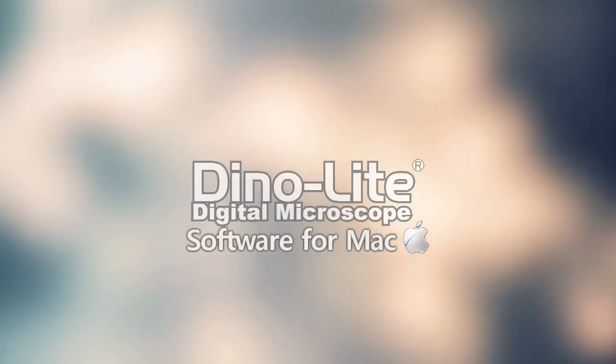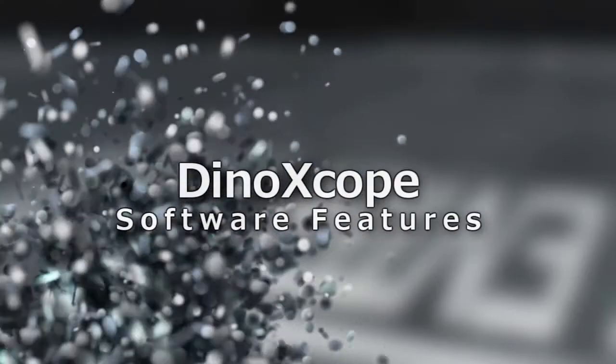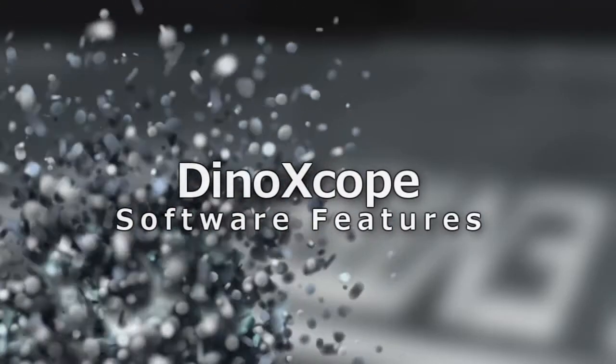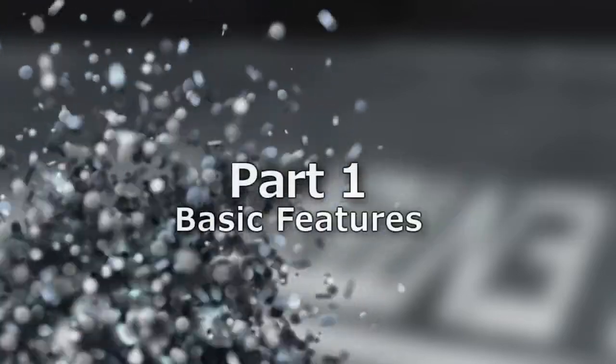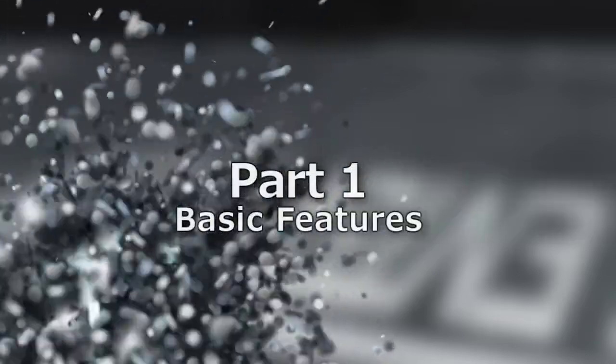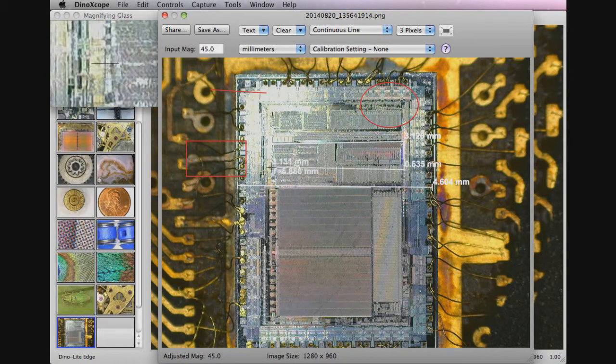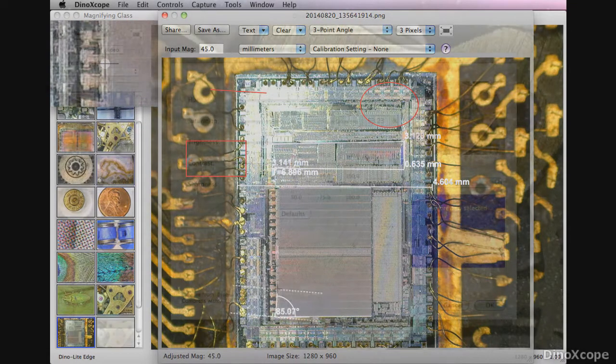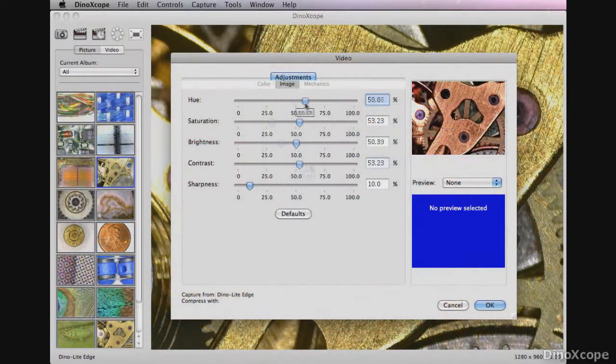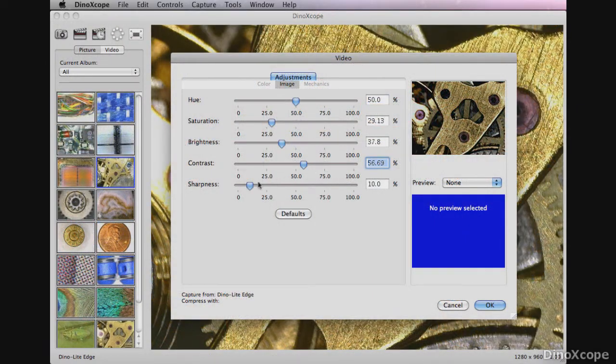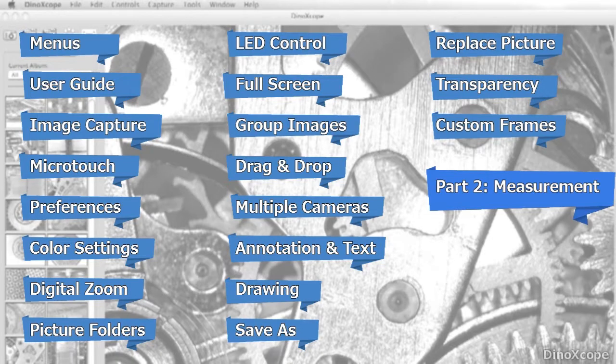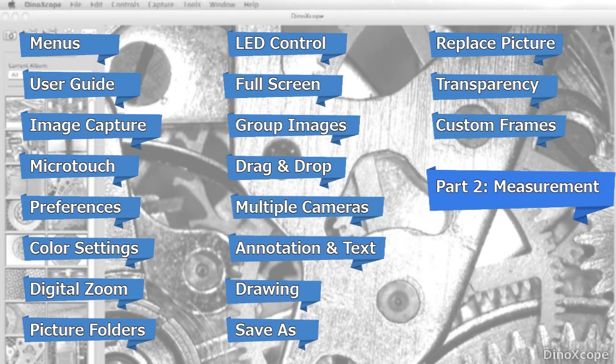This is a video tutorial for the DinoXcope software for Dino-Lite microscope cameras. DinoXcope is the Dino-Lite imaging software for macOS computers. In this video we will go over many of the functions and features of this software. You can skip ahead to any feature by clicking on the corresponding link.